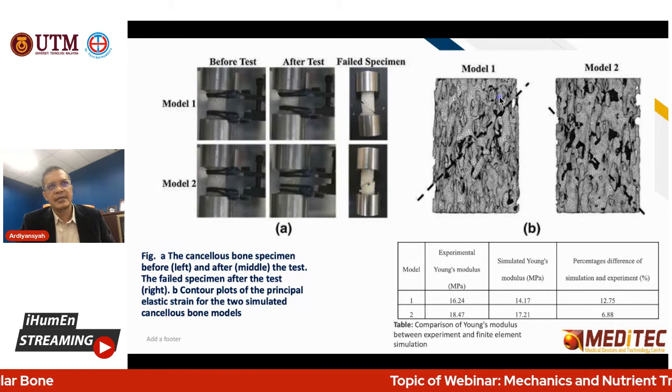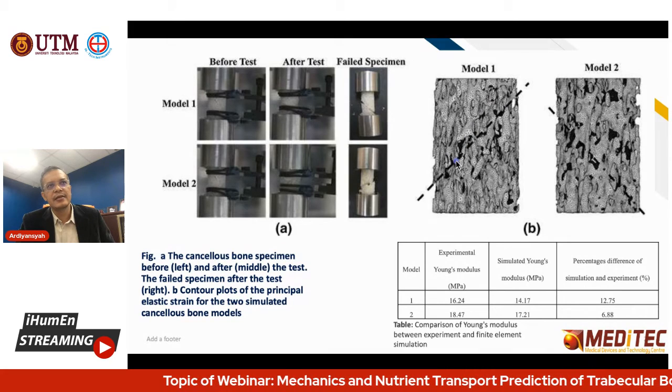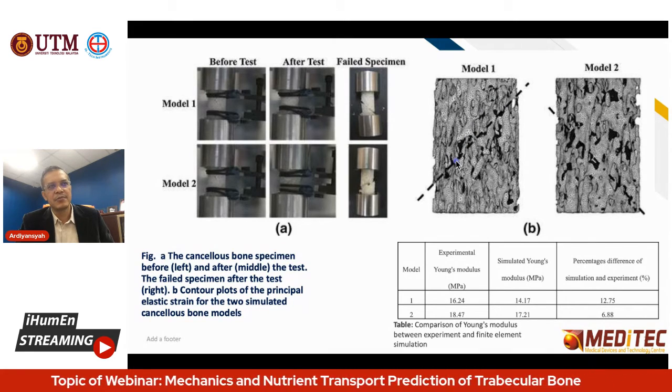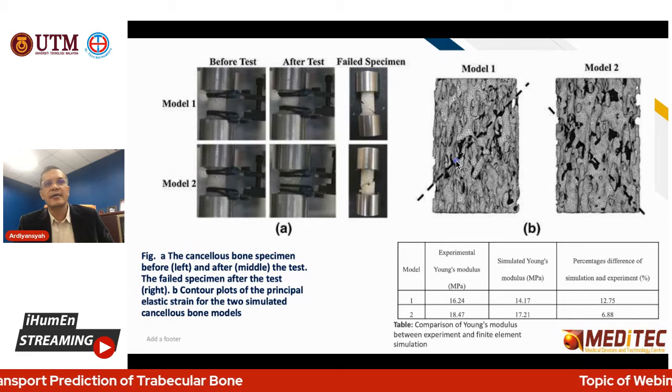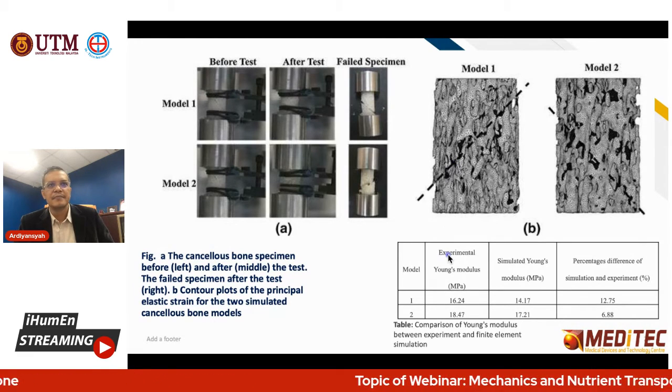You can simulate it exactly and compare with the experimental one. Even the fracture line, with the same model, you can get exactly the same as the experimental.